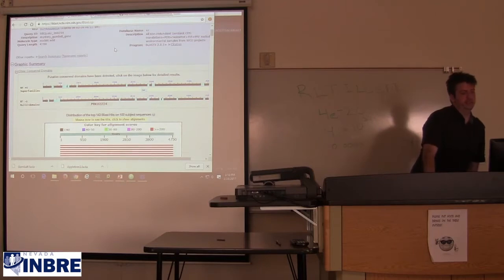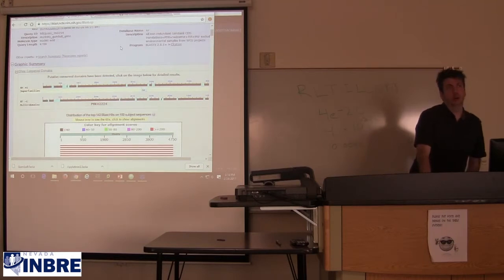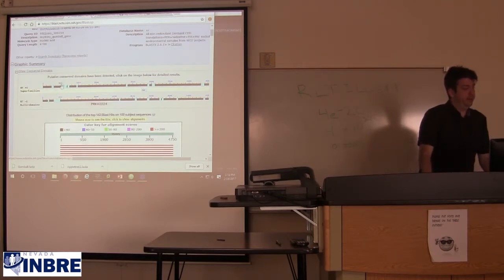This graphic summary has something extra on it because NCBI pre-processes your sequence when you're doing a BLASTX or a BLAST-P to look for common domains, or at least domains that it knows about and has names for, that are conserved widely, or at least somewhat widely. And it says, I don't know if you were looking for these or not, but hey, you have something that's in a superfamily or something here. Maybe you should look into this. This might be a conserved gene.